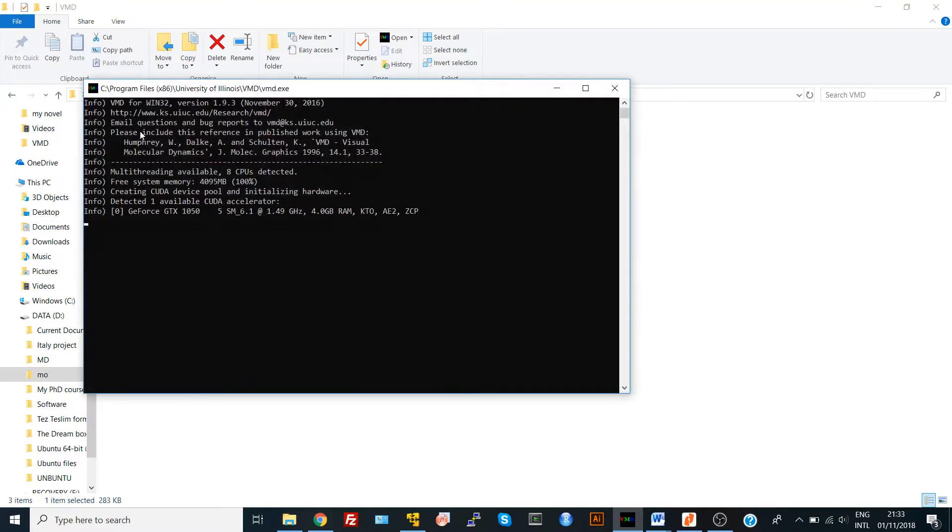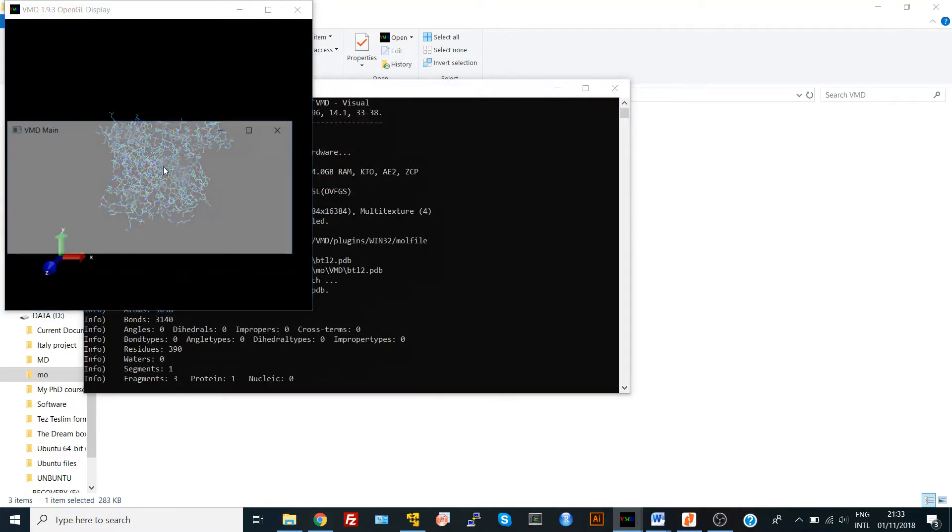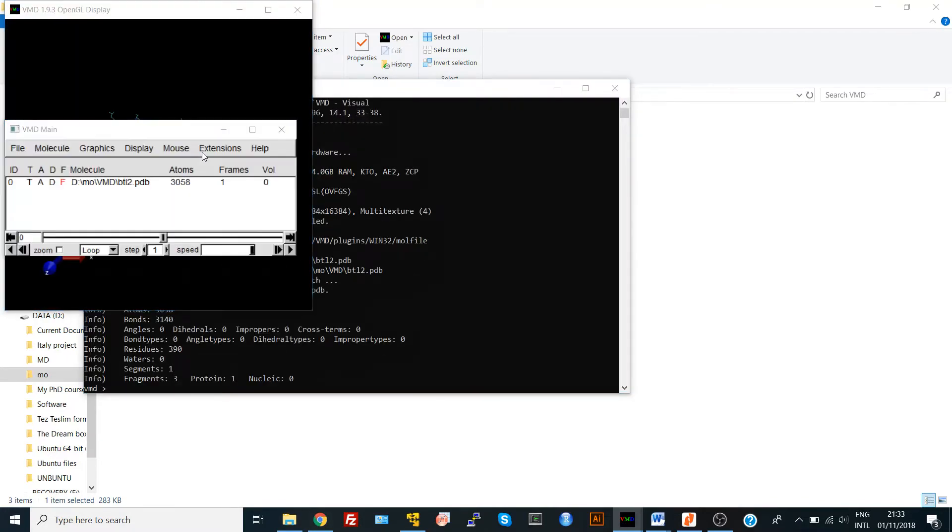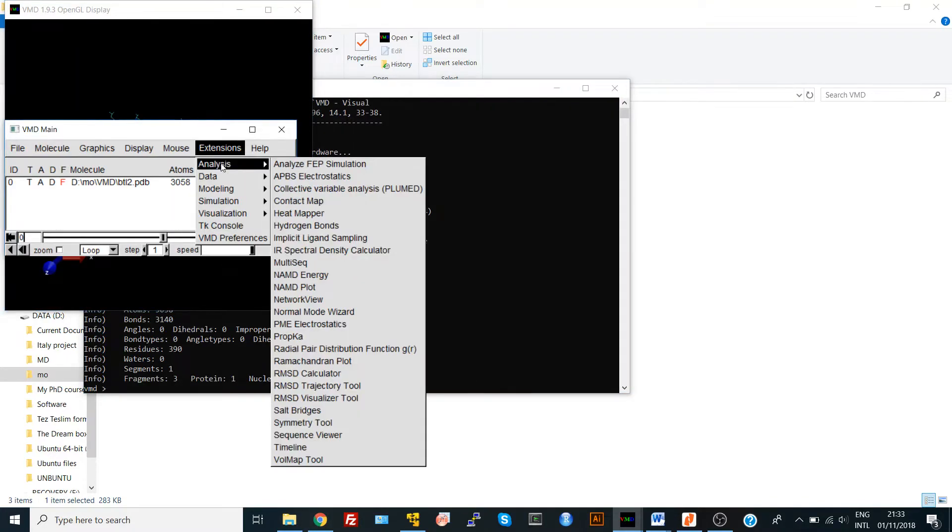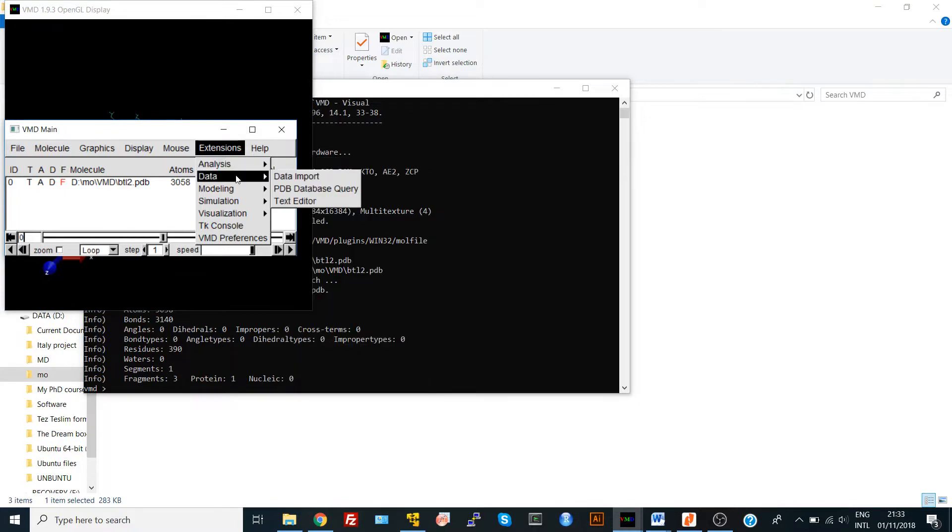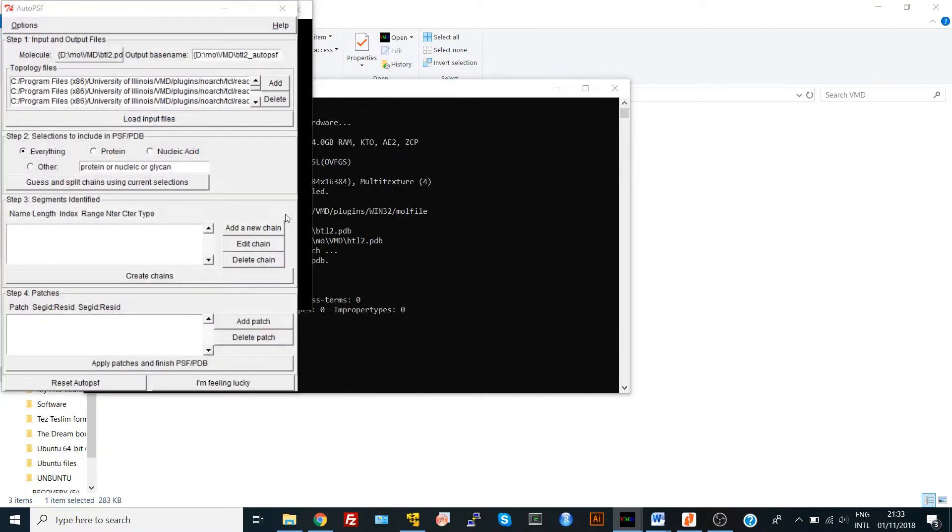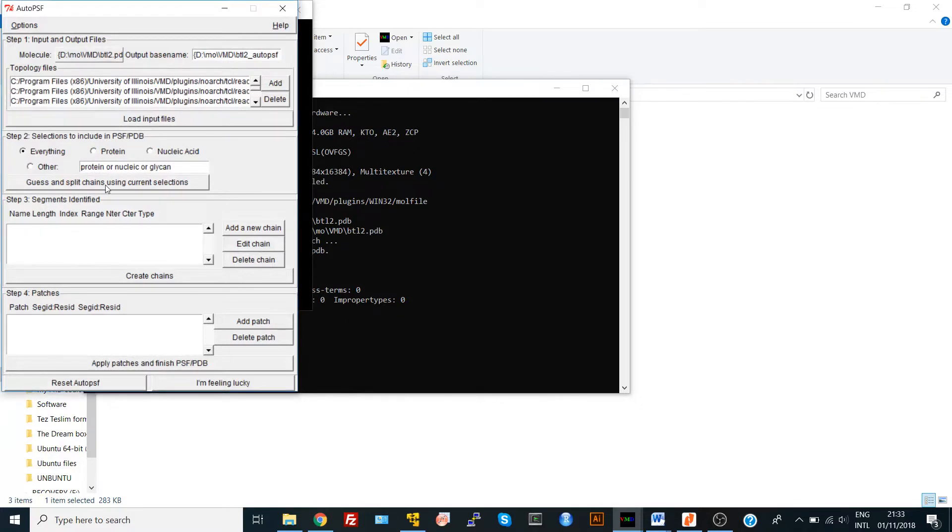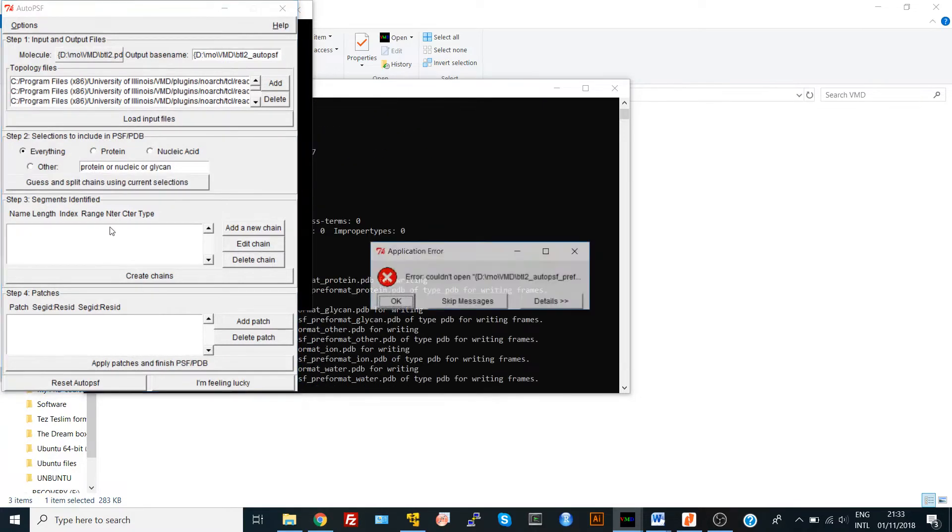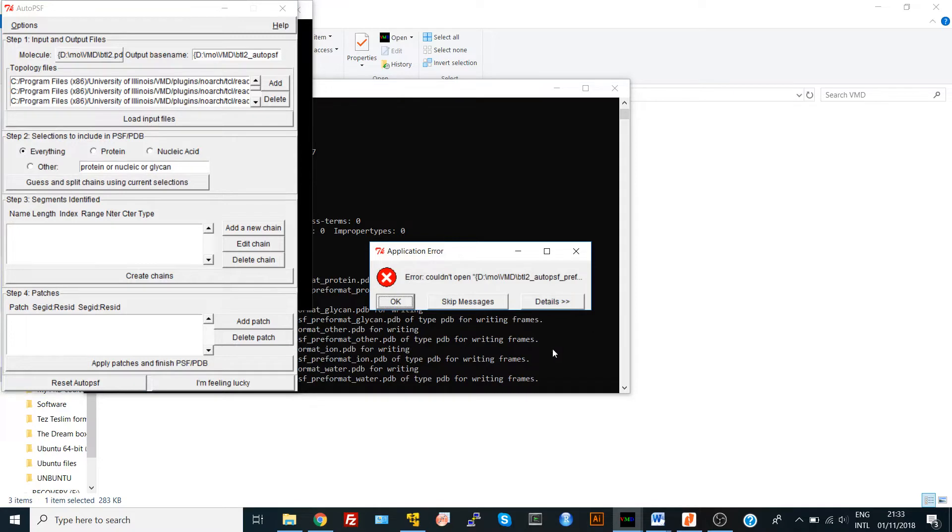You go directly for your protein, open it, go to Extensions as we learned before, then to Modeling, Automatic PSF Builder. We have our topology file, we load it, generate our selections, and you are getting an error. The program couldn't open this file on your computer.